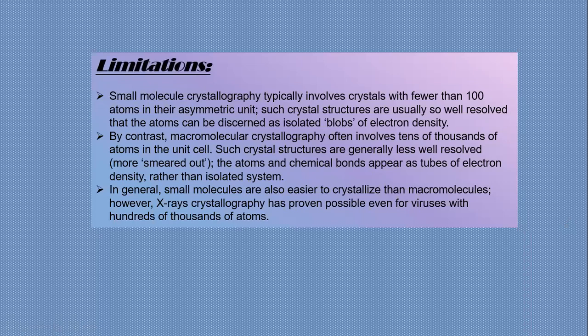And next is limitation. Limitations of X-rays. Small molecule crystallography typically involves crystals with fewer than 100 atoms in their asymmetric unit. Such crystal structures are usually so well resolved that the atoms can be discerned as isolated blobs of electron density.